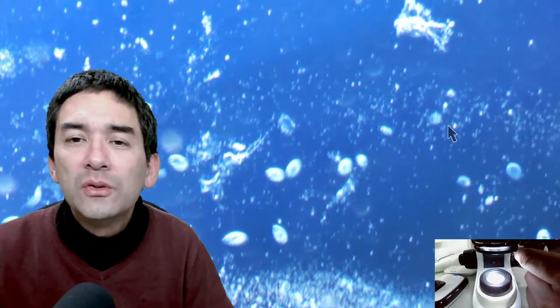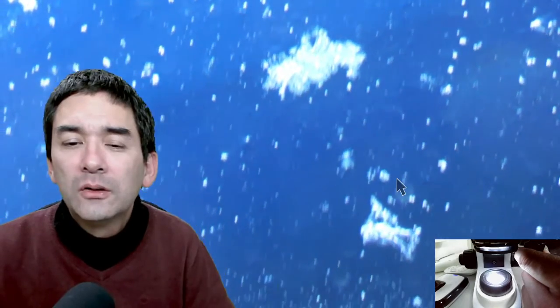Moving the filter holder out a little bit shows how the contrast changes. Look at this — near the center there are only a few bacteria, but over here at the edge there is a huge collection — because they're all moving towards the oxygen, gathering at the edge of the cover glass. I've made some time-lapse videos where you could actually see the bacteria move over time from one side of the cover glass to the other.